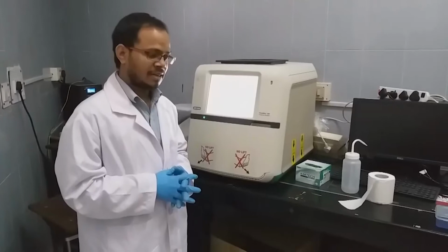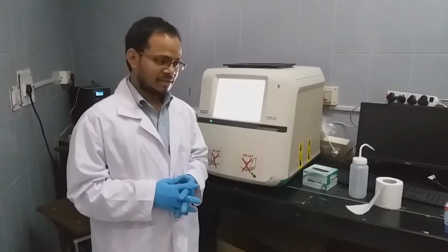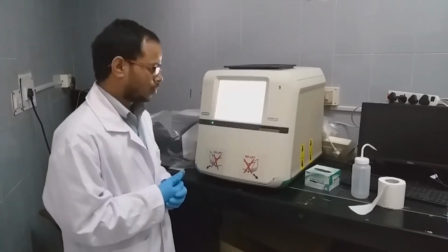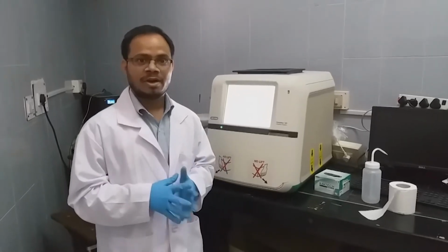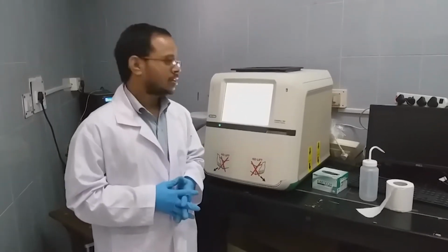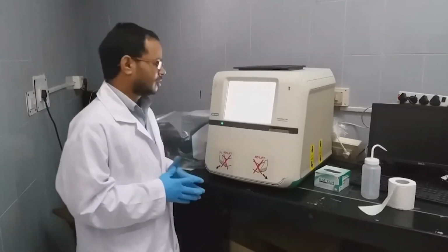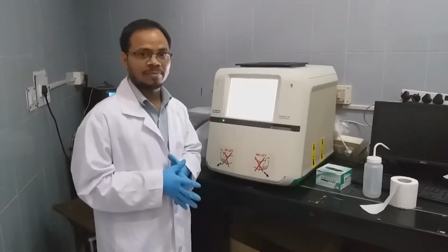We have run the gel, stained and de-stained. Now we will capture the gel image. We can see it manually also, but for record purposes we have to capture it through the gel documentation system. So this is the gel documentation imaging system from Bio-Rad. I'll show you how to capture the images.